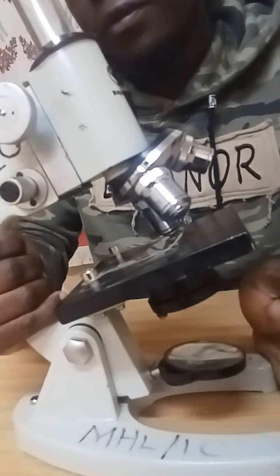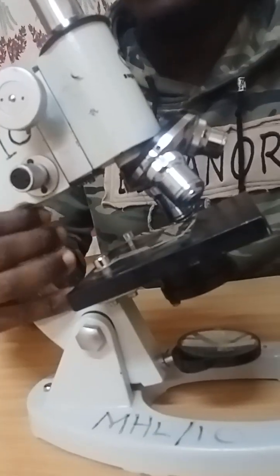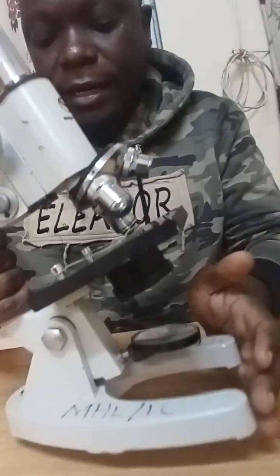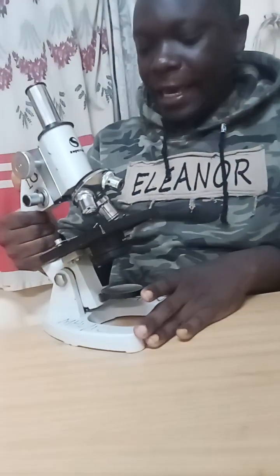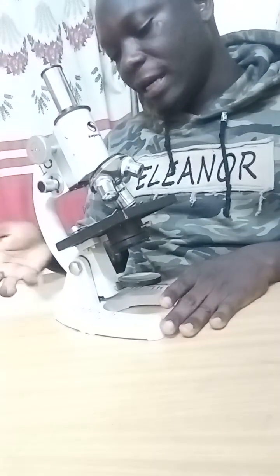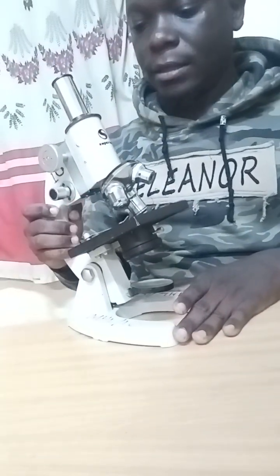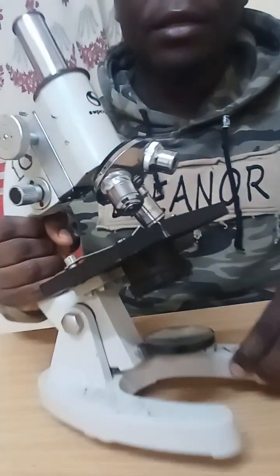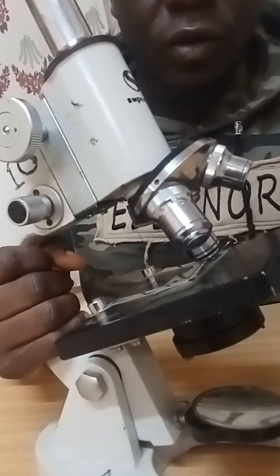Then this microscope should be handled with two hands, one at the base, then the other one at the arm. Then it should not be placed at the edge of the bench, because it can trip and fall, causing losses. Those are some of the safety measures to take when using a microscope.